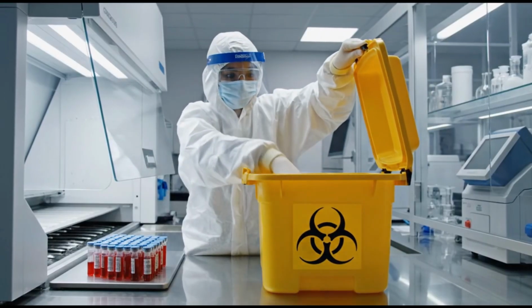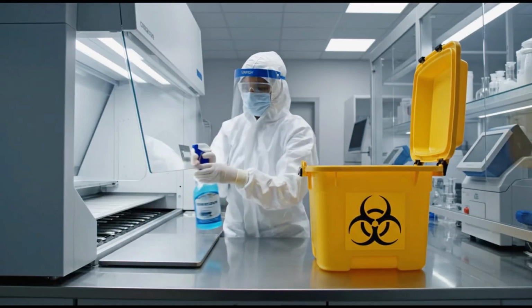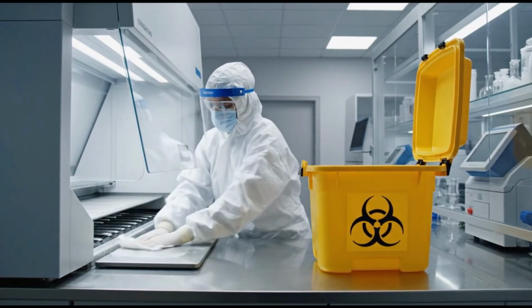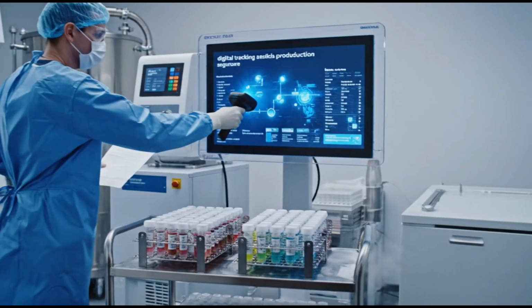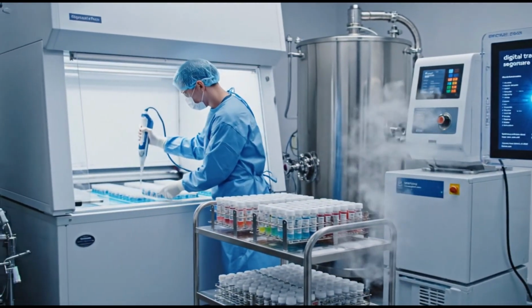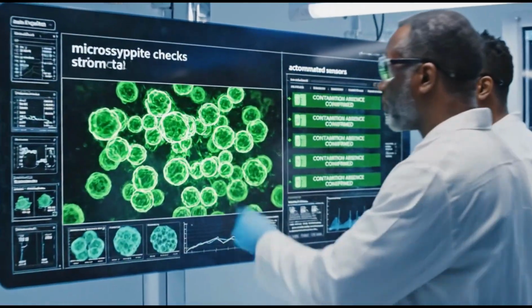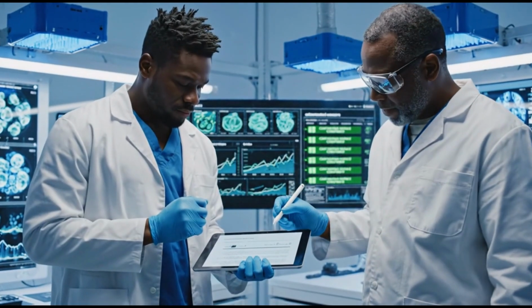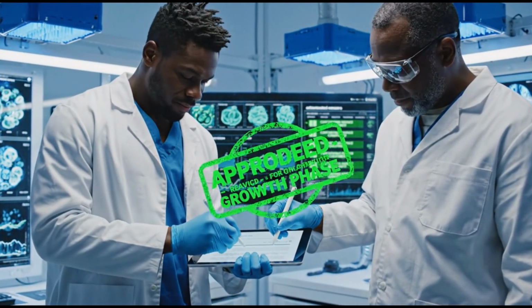Rejected biological material disposed safely. Biohazard containers sealed immediately. Workers follow strict disposal protocols. Batch consolidated and scanned. Sequence confirmed. Moving to cryogenic storage. Final inspection confirms cell stability and uniform structure. Automated sensors show no contamination. Ready for sign-off.